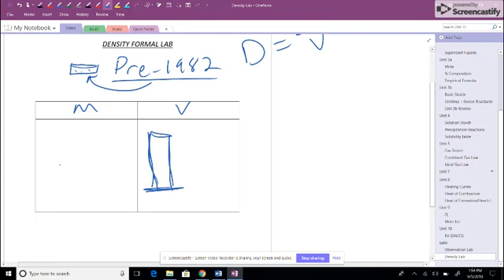So in this lab, I'm going to take all 25 pennies to the electronic balance and put all 25 pennies on there at once. Okay, so here's a pile of 25 pennies, and all those pennies combined read 71.28 grams on the balance. Now, we may not have calibrated that balance at the beginning of class. These pennies probably have some sort of oxidation, some dirt, some dust on them, so they're probably pretty dirty. That could change the mass maybe. So there are some sources of error you can consider in this lab.